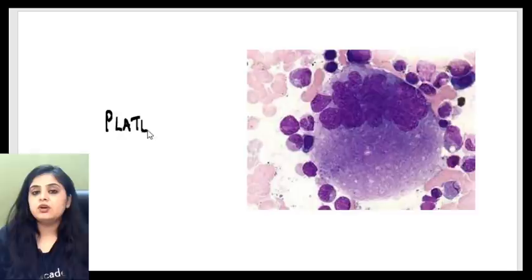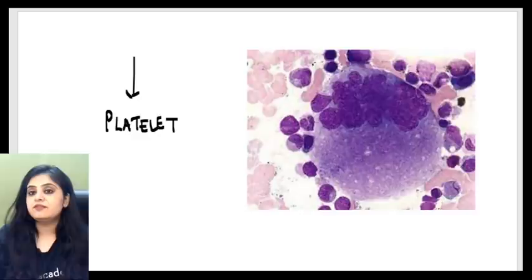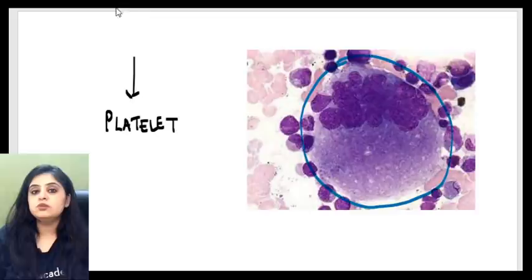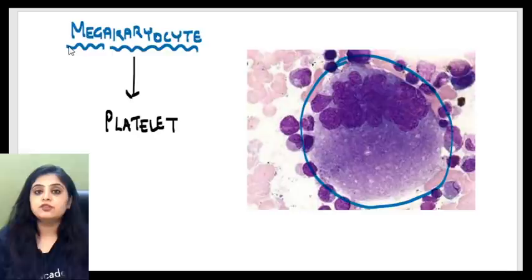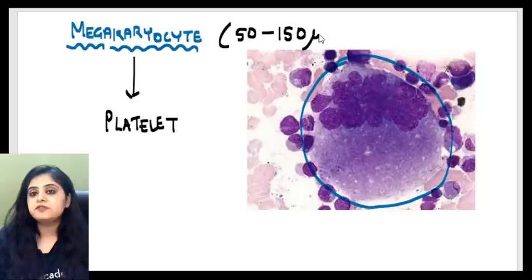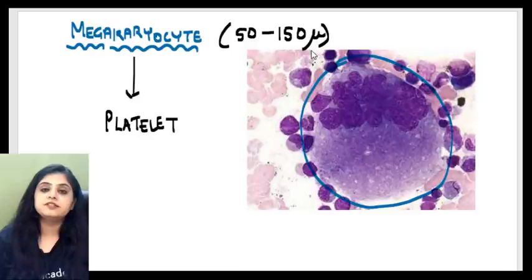We won't be talking about the mature platelet, but about its precursor — the megakaryocyte — which is the image shown to you today. This huge multi-nucleated cell is a megakaryocyte. As the word 'mega' tells you, it's obviously big in size — 50 to 150 microns — much bigger than all the other cells you deal with.